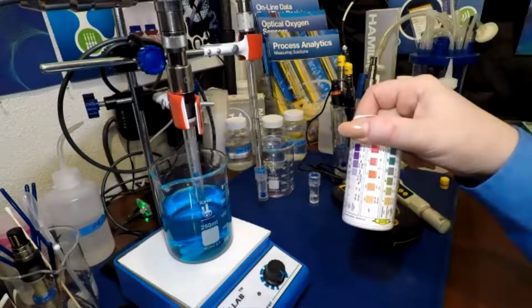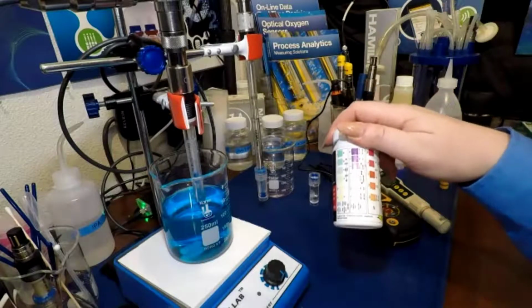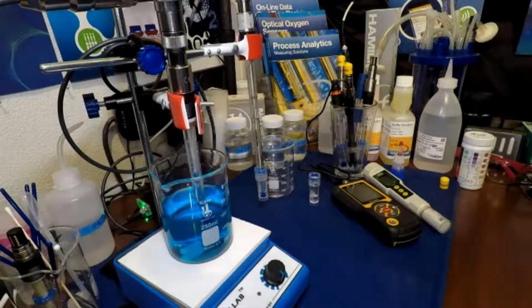Many of us are used to litmus paper strips. This happens to be for my hot tub. But you're used to a piece of paper that's a pH sensitive dye. Those are good. They're fast and dirty, which is great if you're doing a hot tub or swimming pool. Not so good if you want actual high quality measurements.